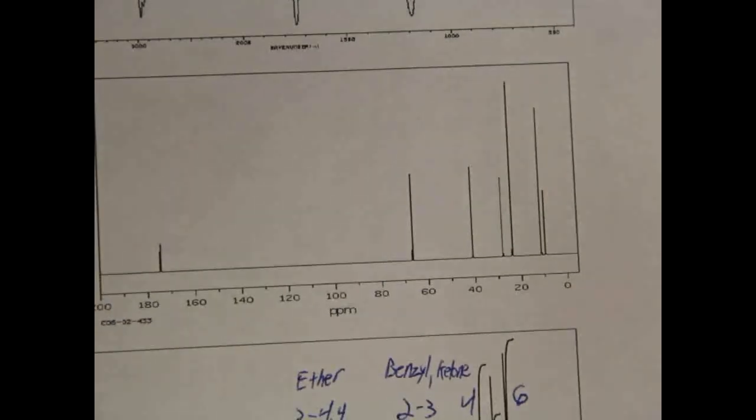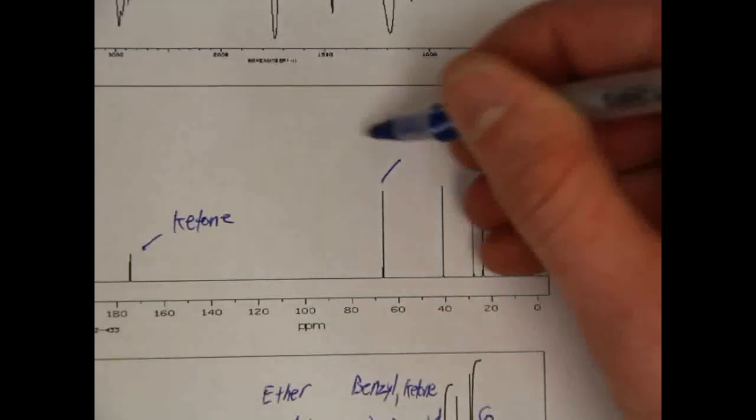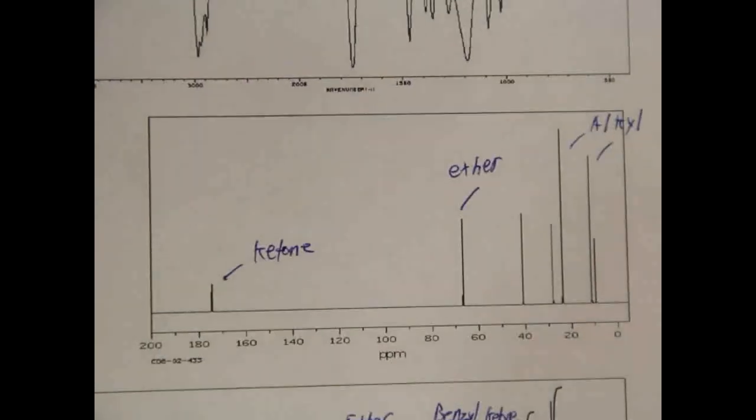For step 5, turn to the carbon spectra and group the peaks into likely functional groups, as was done with the protons. Look for things that enforce or tear down your current structure fragments.